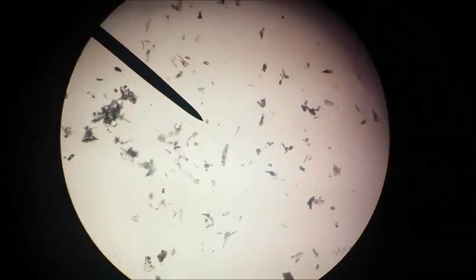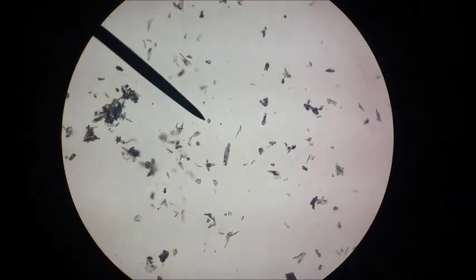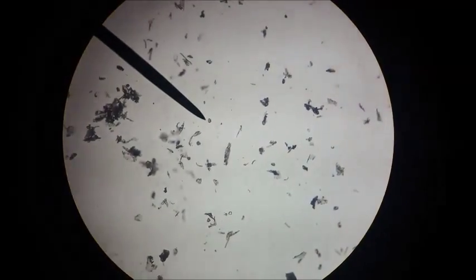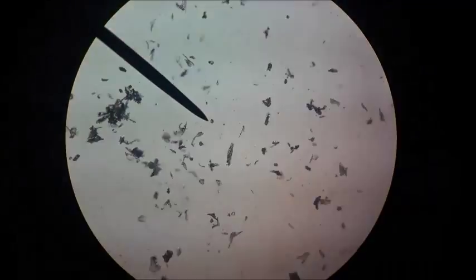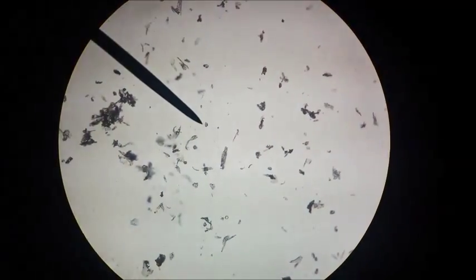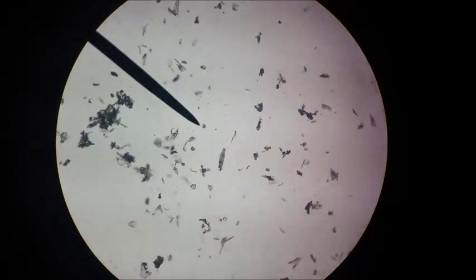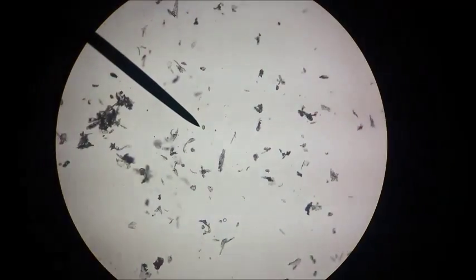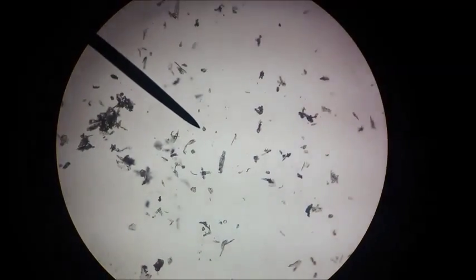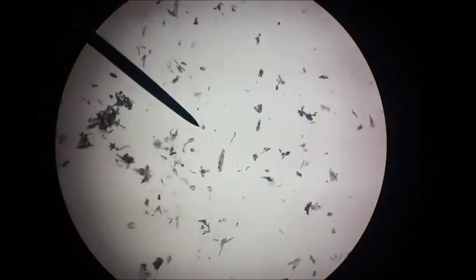Okay, right at the end of the microscope there is a small little squarish cuboidal shaped thing, and if you look around the screen you can see others about that size. That's kind of what I'm seeing when I look on the internet for a water mold. Black mold has a more oblong seed-like spore. Anyhow, that's what I'm seeing so far. So we're going to try that little clump next and see what we can figure out.